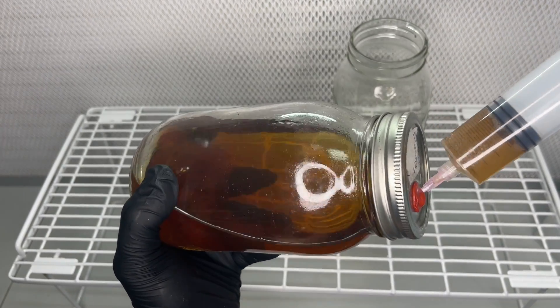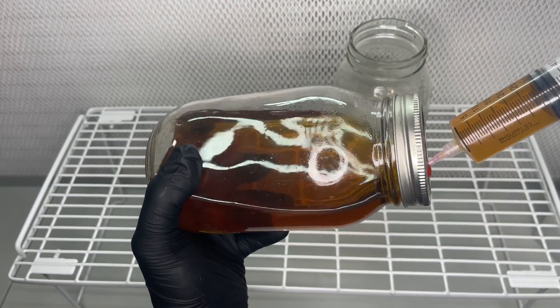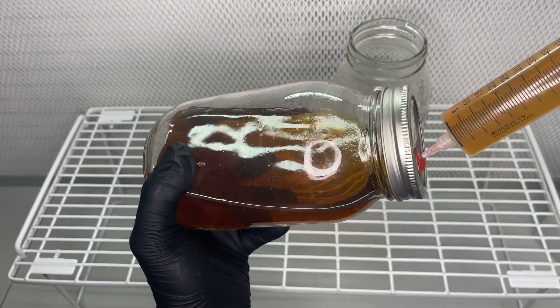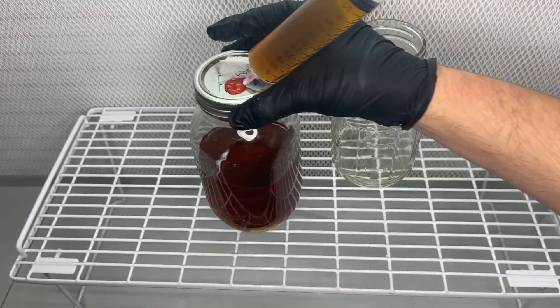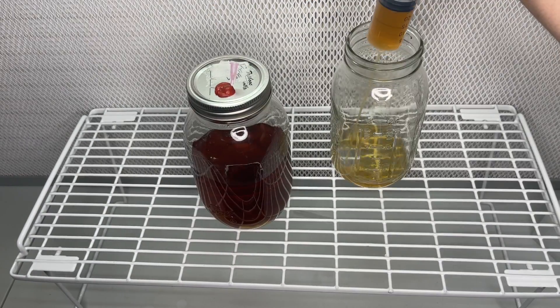When the mycelium doesn't grow up to at least half of the jar it makes it difficult to make syringes out of it. In one of my previous videos I actually used this same method of extracting the excess liquid, leaving behind most of the mycelium, which would allow you to make thicker syringes.